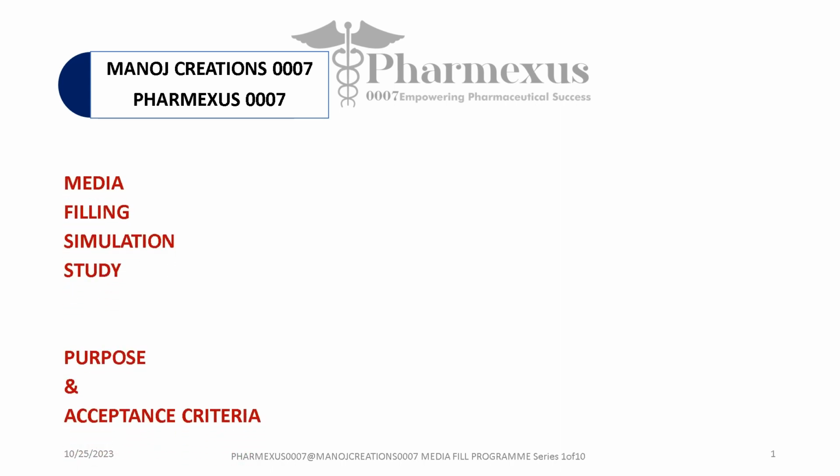Today's discussion and elaboration point will be on the media filling simulation study basic data, its purposes and acceptance criteria.